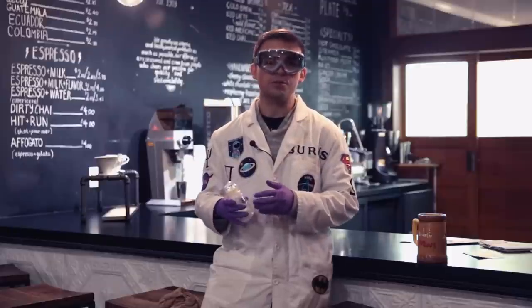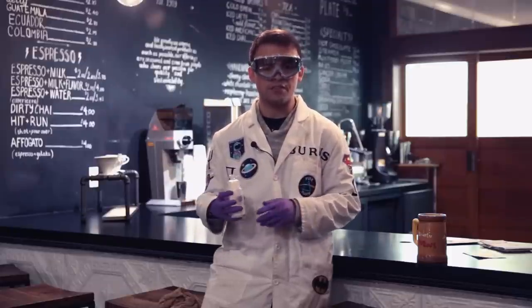If you're interested, we used Vietnamese Robusta coffee beans for this experiment. That's because of their very high caffeine content.